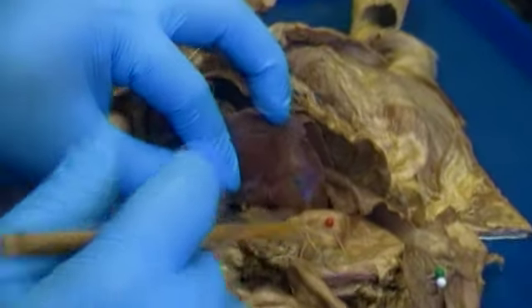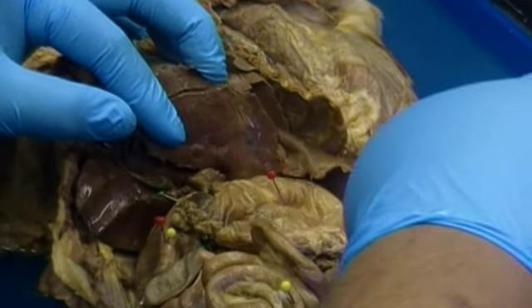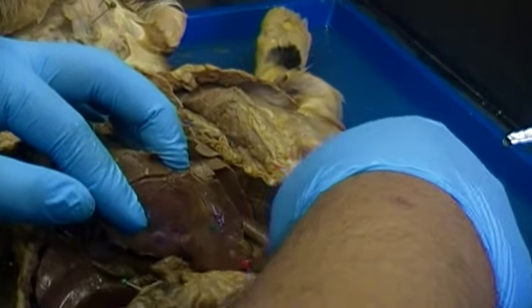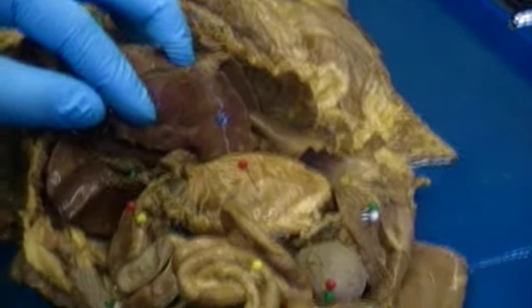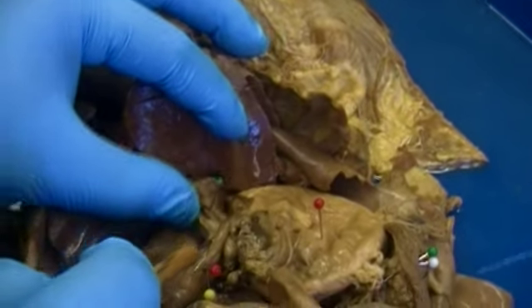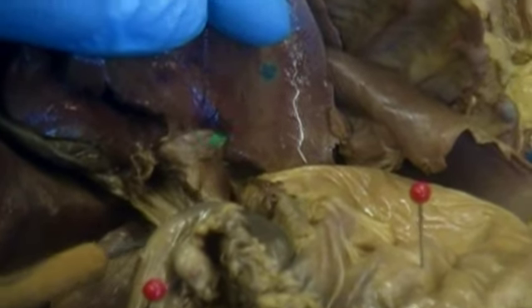Now moving this back a little so we can see this structure labeled with a red pin — this large structure is the stomach. The stomach is connected to the liver by this membranous structure labeled with a small green pin. That would be the lesser omentum.